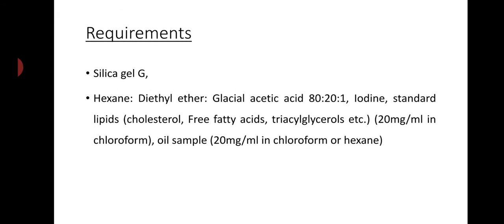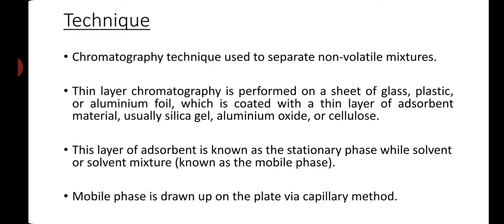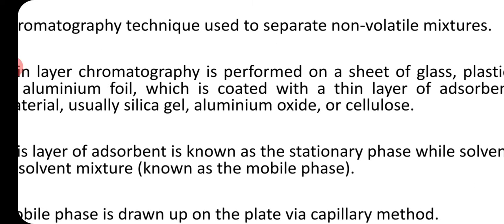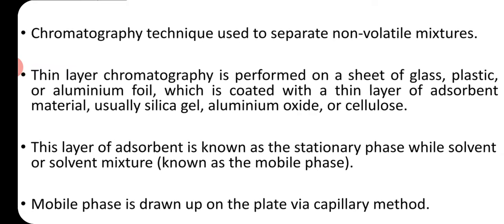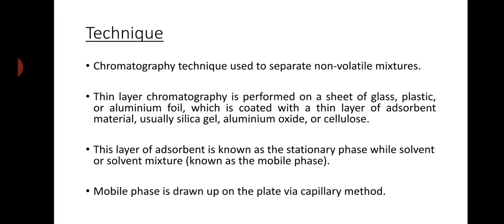Okay, next thing. Let's talk about the technique. The chromatography technique is used to separate non-volatile mixtures. You have to find out the identity of each component, because there is a mixture of components present in a particular solution. For example, if you are taking plant extracts, there are so many components present in them, and you want to separate them, right? So you will be using the chromatography technique.